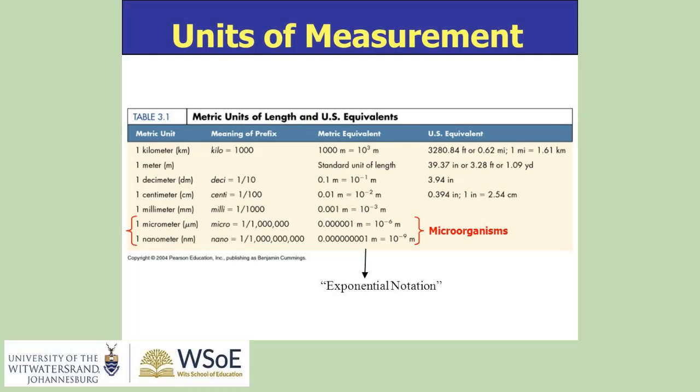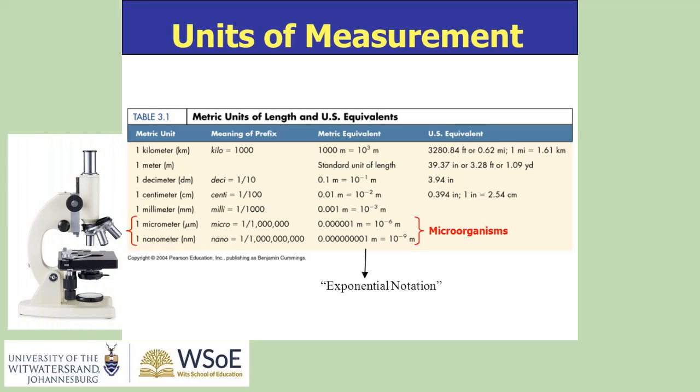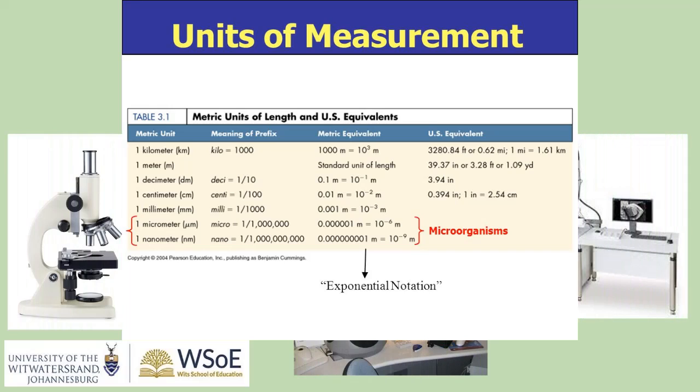Before we look at the actual content on the light microscope, I would just like you to listen to Dr. Nayampangendu explain the units of measurement so you can get a better idea of how small the units actually are when it comes to looking at cells under the microscope.